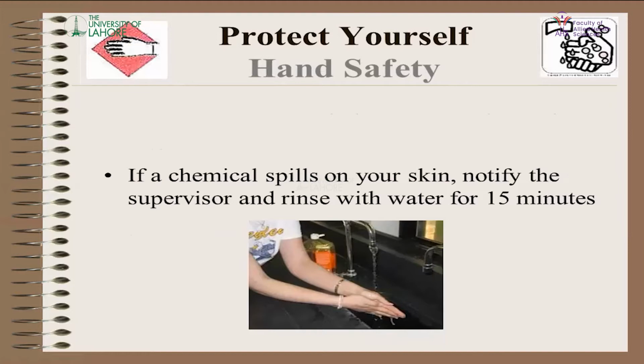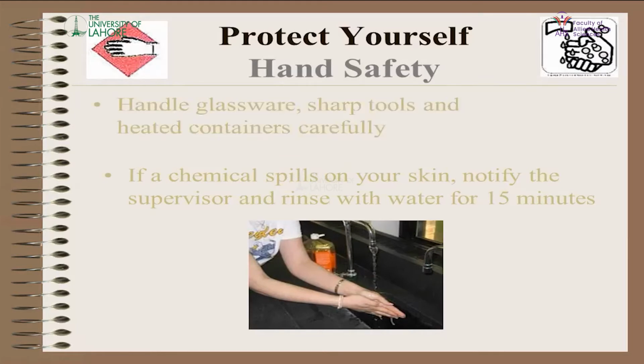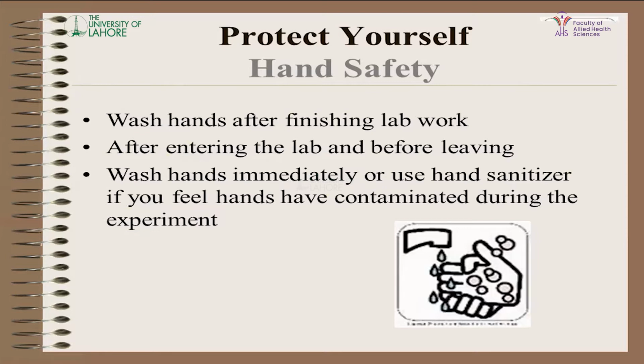Next point would be hand safety. Hand safety is very important in terms of the biosafety steps. Handle glassware, sharp tools, and heated containers carefully. If a chemical spills on your skin, notify the supervisor and rinse with water for 15 minutes. Wash hands after finishing any step, long procedure, or experiment. If they are finished, you have to wash your hands or use hand sanitizer for cleaning.